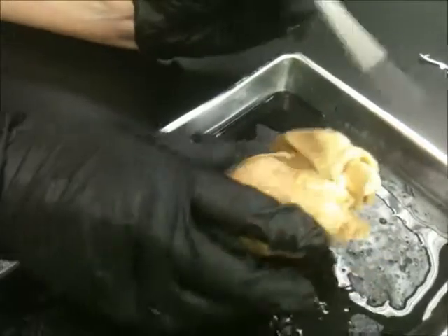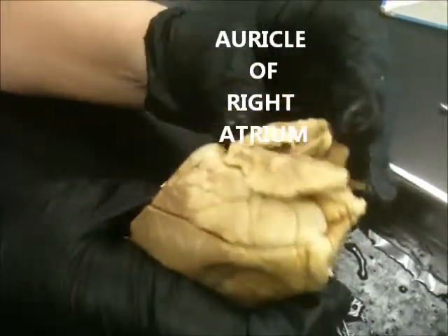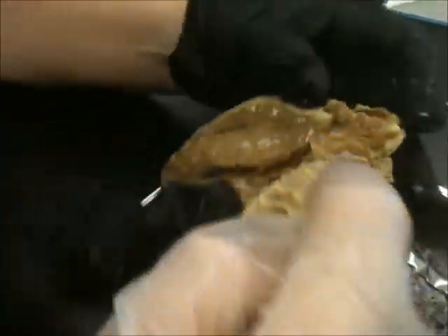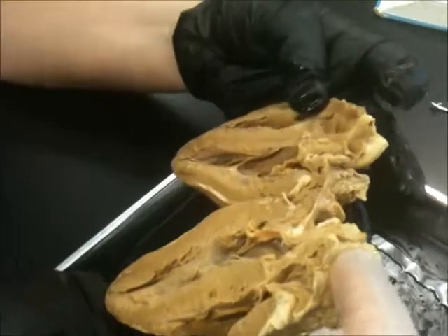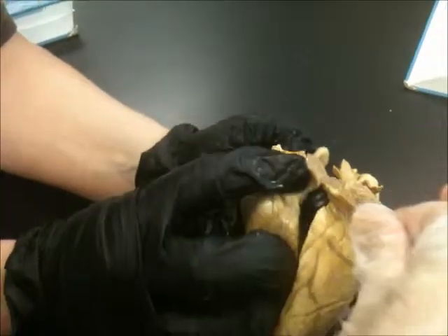So we've got the auricles, right? We didn't do the auricles. The auricles are... that's her auricle. That's the right auricle? No, that's going to be the right auricle. This is right and this is left — that's correct. So that's the right auricle, she's absolutely right. And then the left auricle is right here.